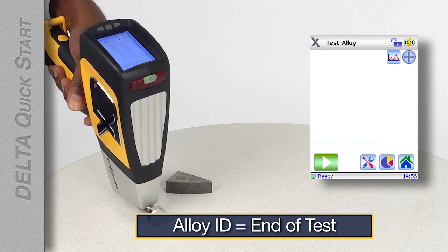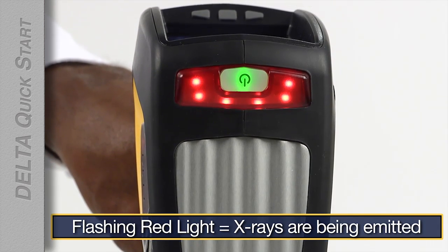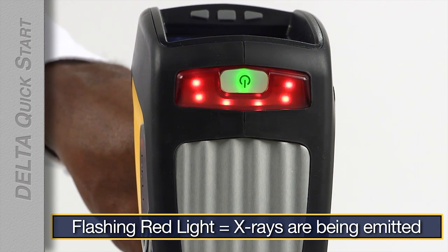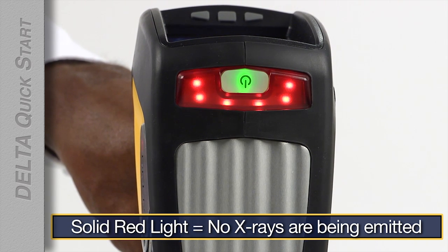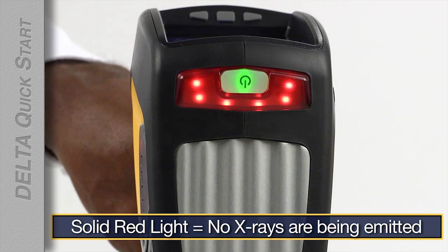Remember, when the X-ray indicator is flashing, X-rays are being emitted. When the X-ray indicator is solid red, the X-ray tube inside the analyzer is powered on but not emitting X-rays.